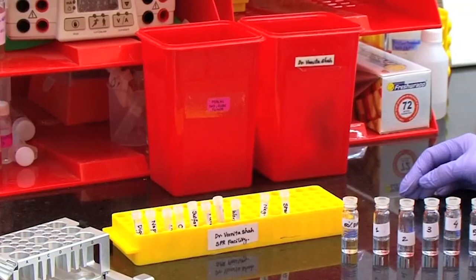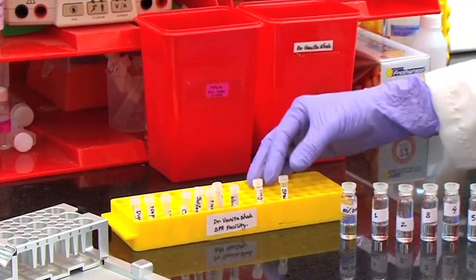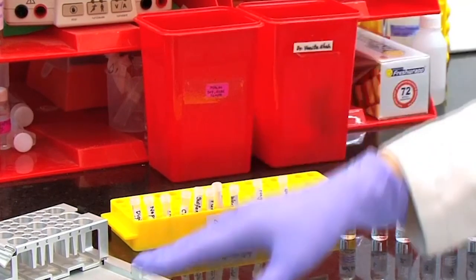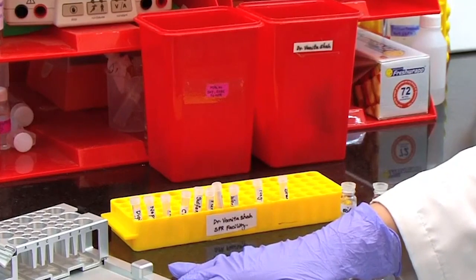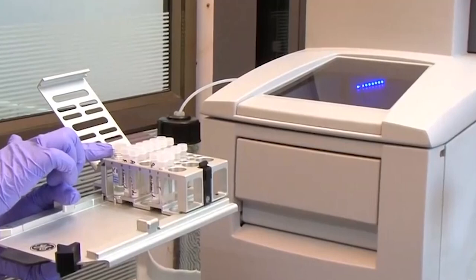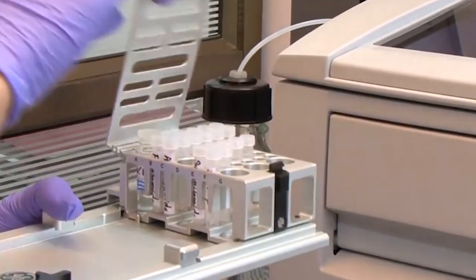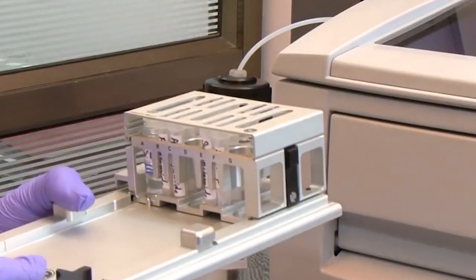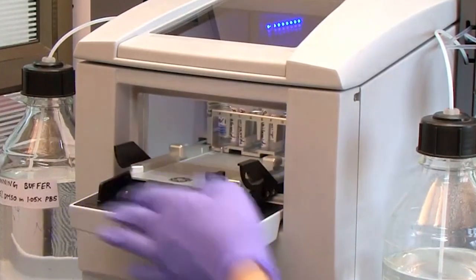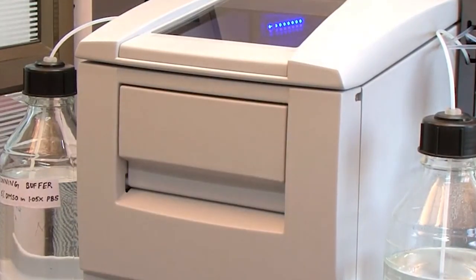We will now proceed to insert these tubes, including the samples at 30 micromolar concentration, the negative control, the startup, 50% DMSO as wash solution, and the solvent correction solution into the appropriate rack and then into the system to perform the protein small molecule screening assay. We have now placed all our tubes inside the rack. We are placing this rack inside the system to start with our screening assay. We will now start with our run as demonstrated in the earlier lectures.